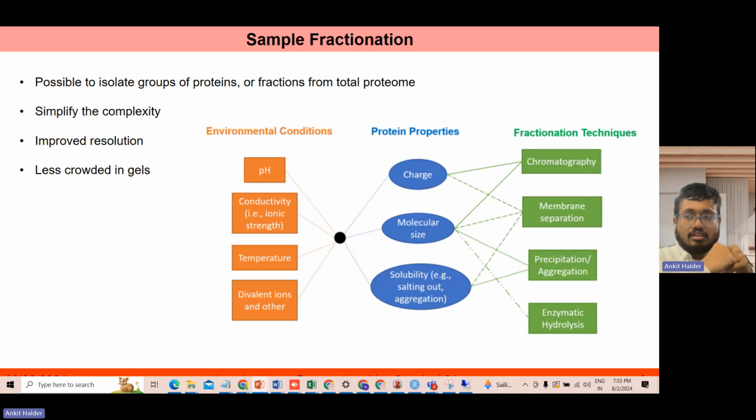Second, the cells are disrupted, the cell walls are broken, and the protein constituents and contents are in the medium. Now the protein is liable to be attacked by the proteases that are present in the environment, in the tube, in many places, in your hand. Whoever is doing the experiment, everywhere there are certain kinds of proteases, among which there are serine proteases, cysteine proteases, metalloproteases, etc.